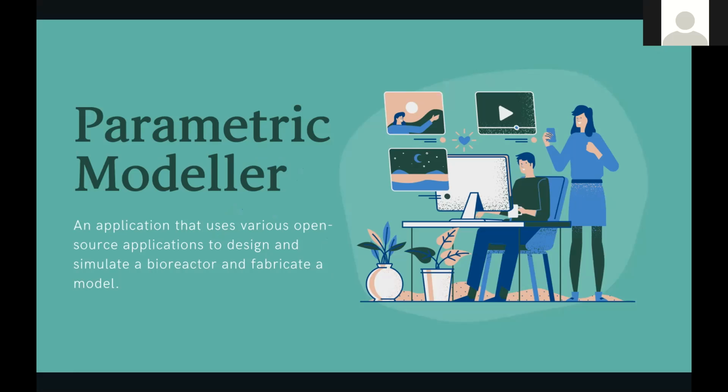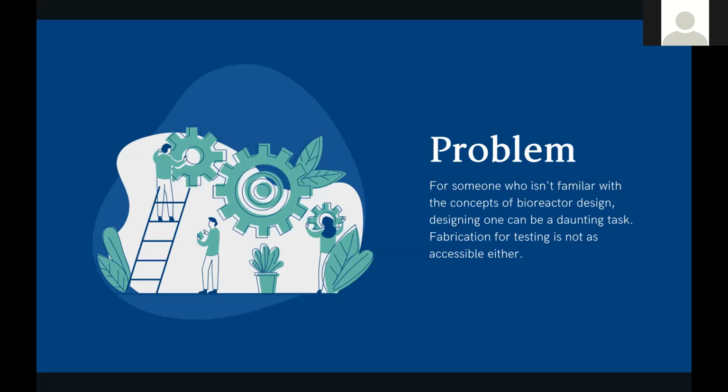So moving on to the problem. We feel that a lot of people in the scientific community that focus on the biology aspect do not know the concepts of bioreactor design. That's more of an engineering side of things. So designing one can be a daunting task, especially when you're just an undergraduate student who's focused on the science. And even if you have designed something, fabricating is quite difficult, and there's a lot of middlemen involved, and it might be a bit costly as well.